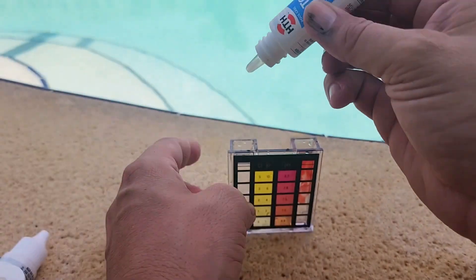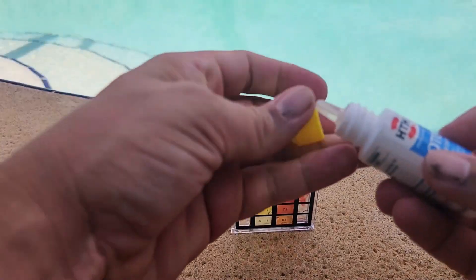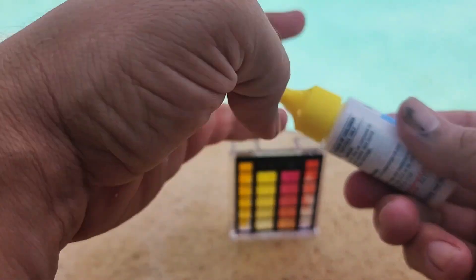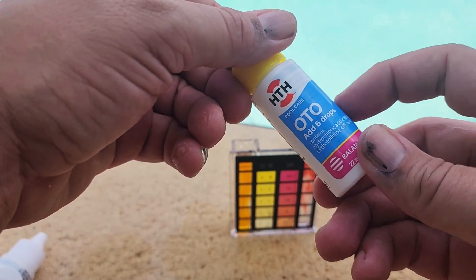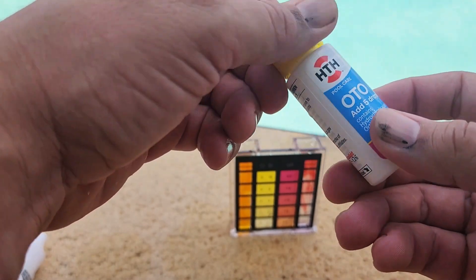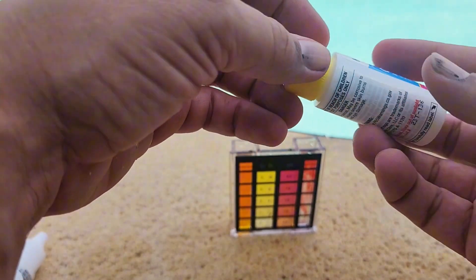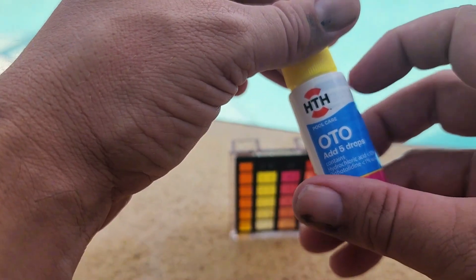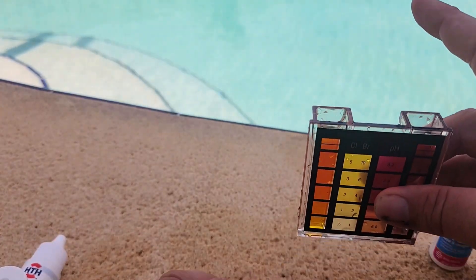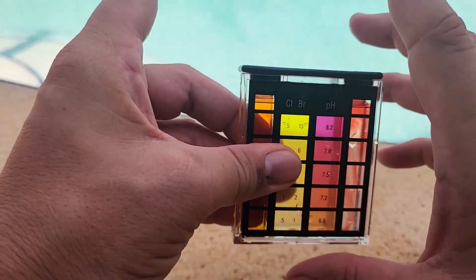On the left side we're going to do 5 drops of the yellow solution. I love these bottles — they're so easy to get single drops out of. I did another test kit earlier where the drops came out as a stream and I had to be super careful. These are really nice, they're meant to make drops come out. Next, put the top back on — which is super easy — and shake.